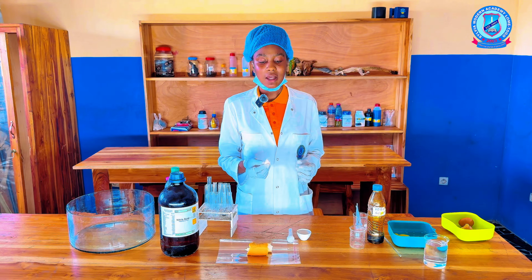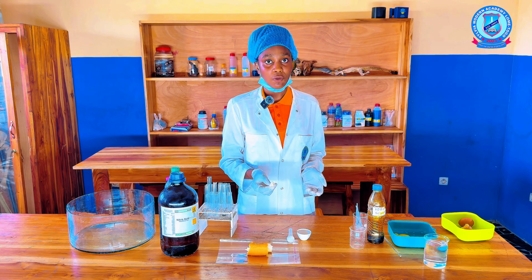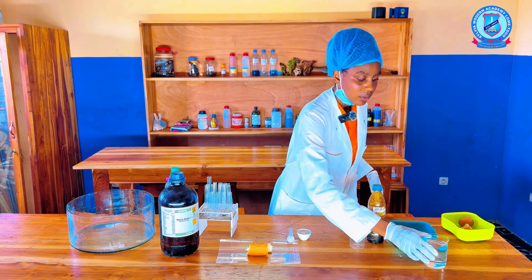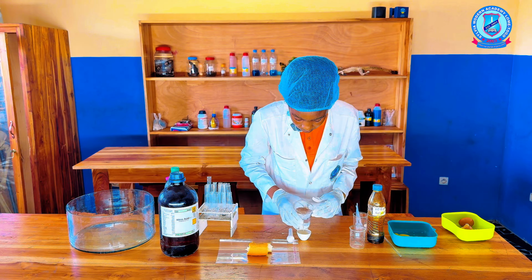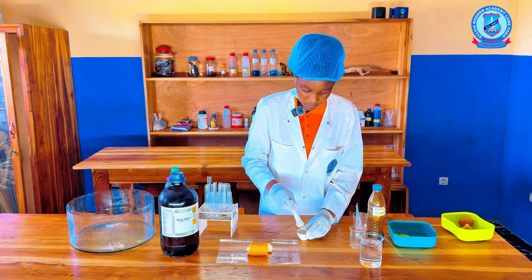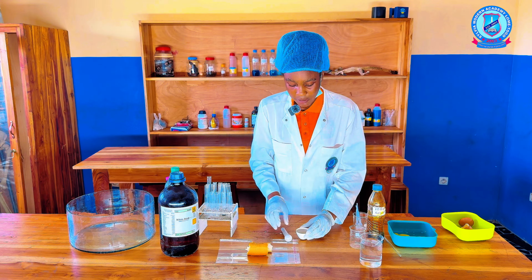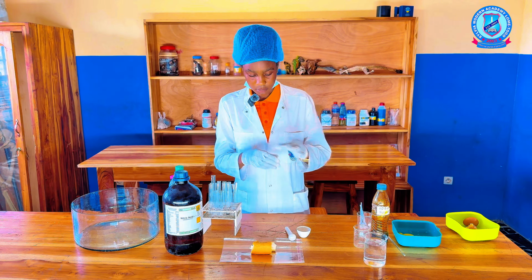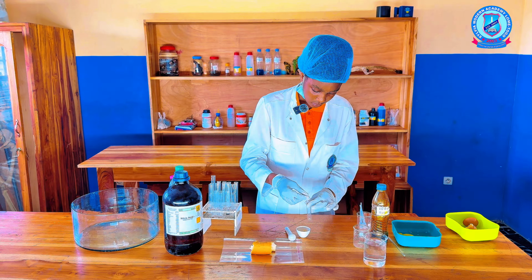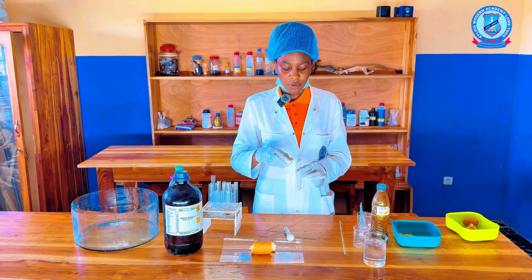So the bread is hard, so we're going to make it a little bit moist by adding a little amount of water in our mortar. So the bread is moist. We're going to add it to our test tube. So we're going to add the water we used in making the bread moist.